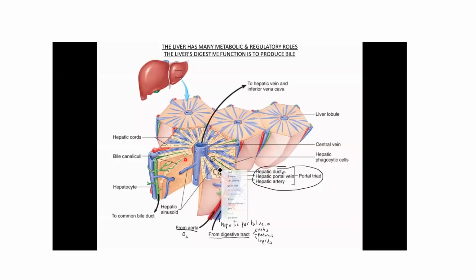This is a reminder of the histology or histological portions or components of the liver. حكينا الportal tract فيها a branch of the hepatic artery, a branch of the portal vein, and a branch of the bile ducts. إيش اللي بصير في flow through the portal vein of blood through the sinusoids ما بين liver plates.